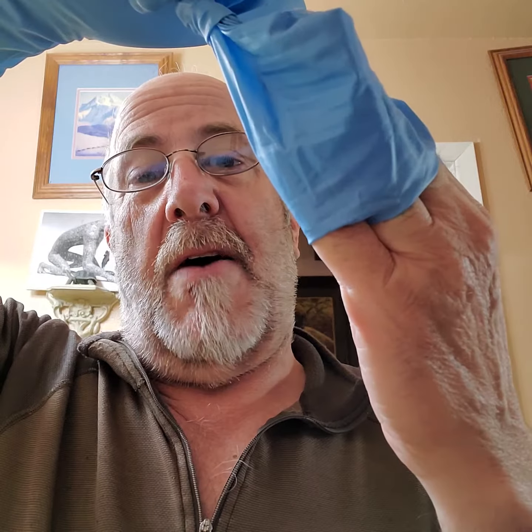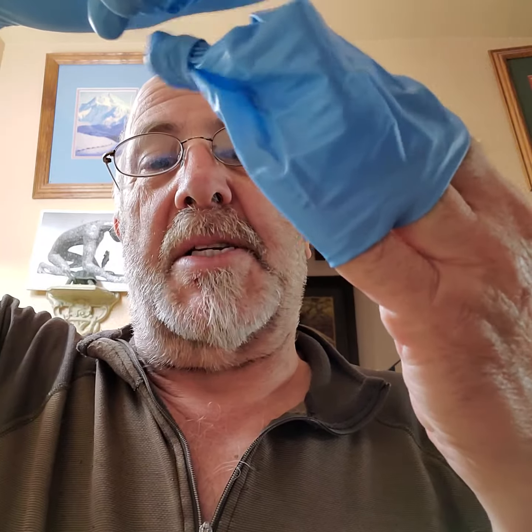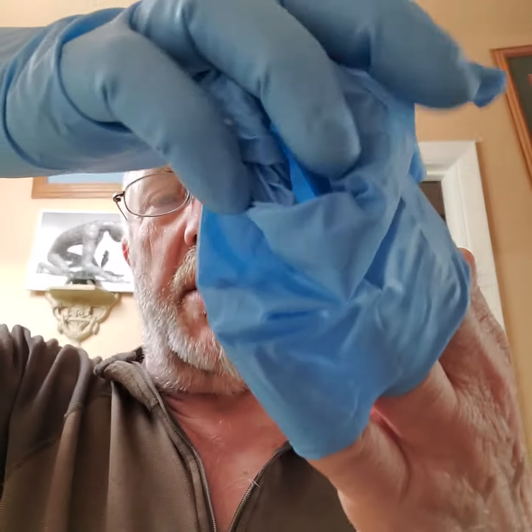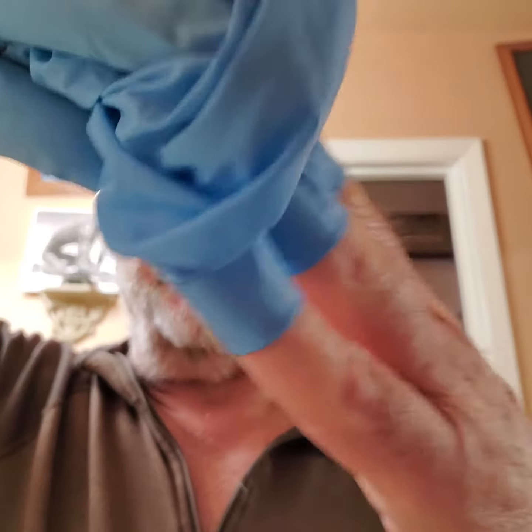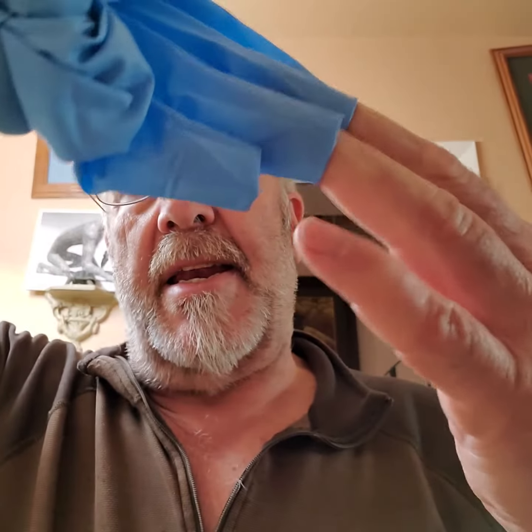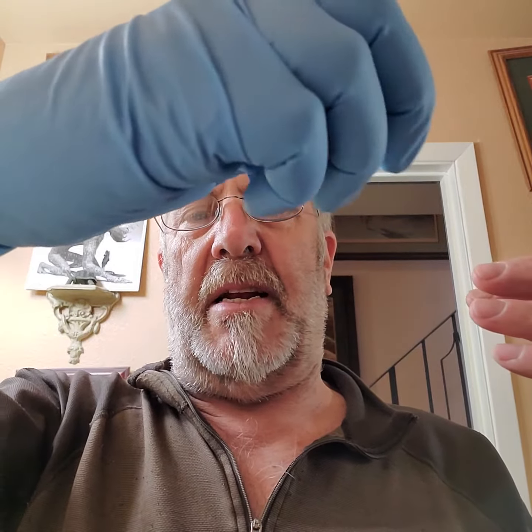You'll notice the glove inverts inside out — that's totally good, because now theoretically that contaminated material is further into the glove. Before I pull it all the way off, I just grab the glove and gather it into my still-gloved hand. Now I have a contaminated glove held inside there.